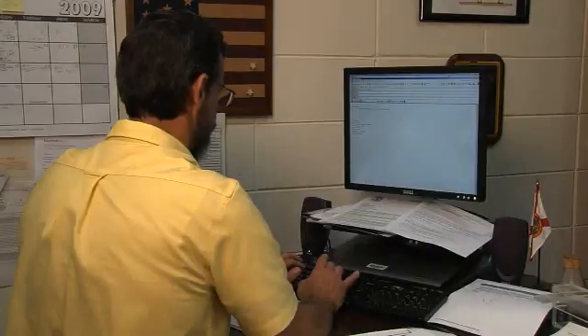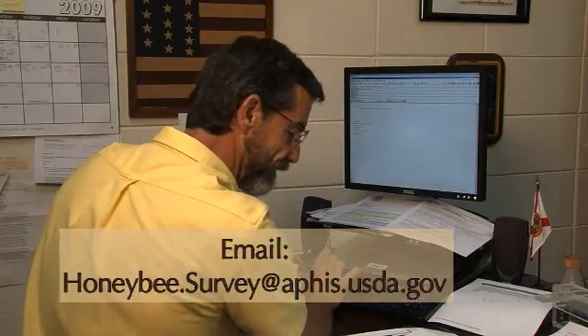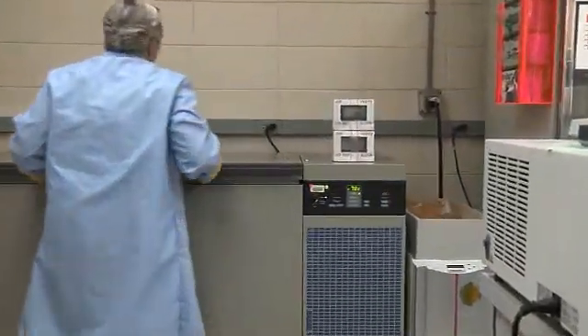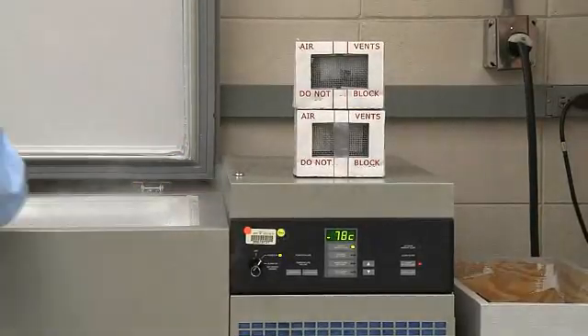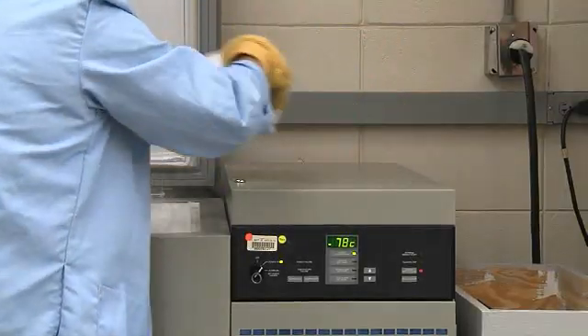To ensure the USDA is prepared to receive a live shipment of bees, email USDA within 24 hours of mailing. Once the live bee samples arrive at the USDA, they will be placed in a freezer set to minus 80 degrees. At a later date, these bees will be tested for parasites and pathogens using molecular techniques.